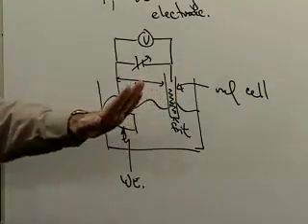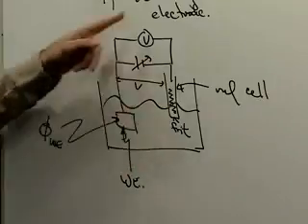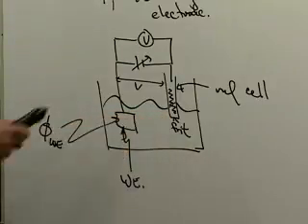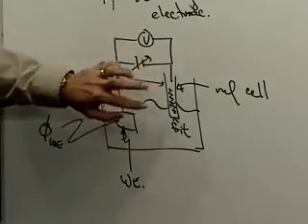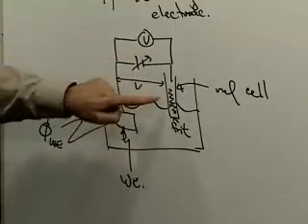Now, after some time, you are going to run into a second problem that not even your freshman can solve, and that is, obviously, if I'm, say, reducing something at this electrode, then I am oxidizing something over here to compensate for that. So even though I start off with this cell with a given amount of oxidant and a given amount of reductant, over time that ratio changes. And so the potential I think this cell is at is varied. But if I used high concentrations over here, then I'd have some period of time anyway before I change that ratio significantly, and the Nernst equation got me into trouble over here.